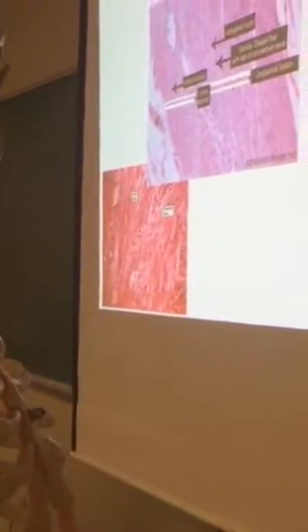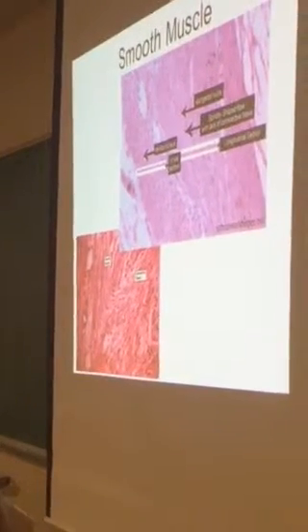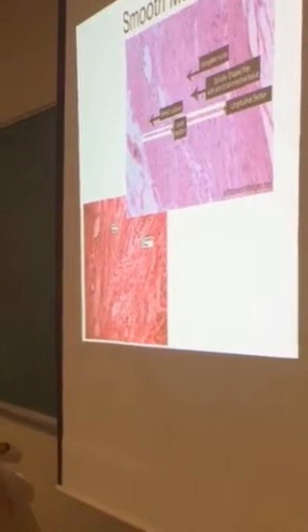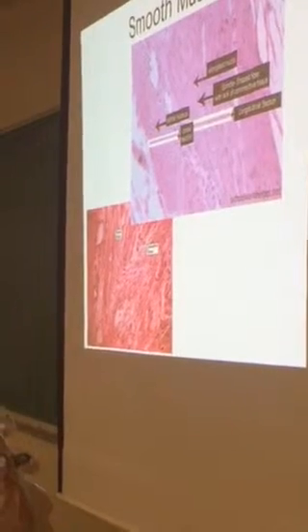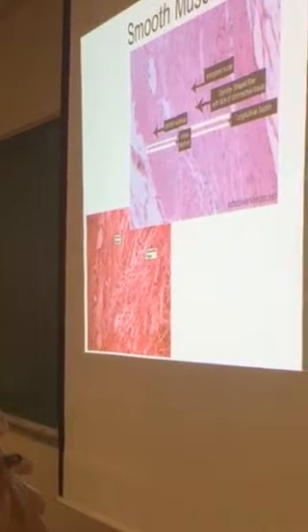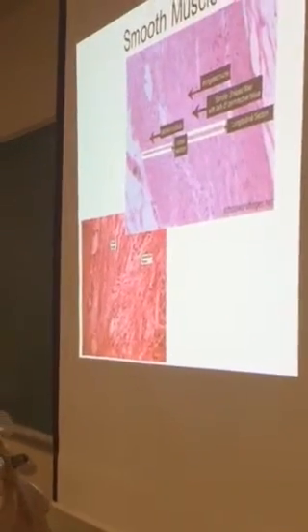This is more typical of what you have on your slides though. So what type of tissue is this? Smooth muscle. Dense irregular. Your best bet is dense irregular. Right. This is your smooth muscle. Your very long, elongated nuclei. Generally, there's only one nucleus per muscle cell of smooth muscle. That is not true of the other two muscle types.